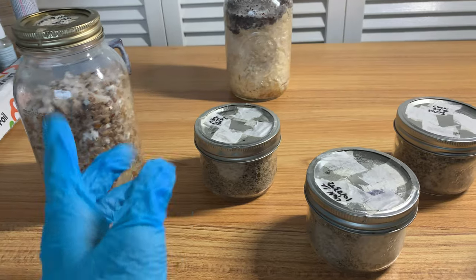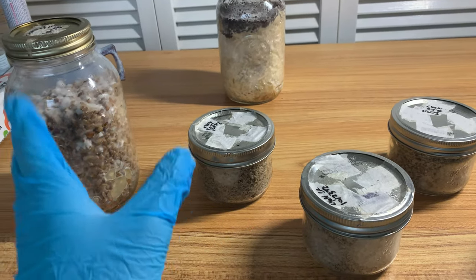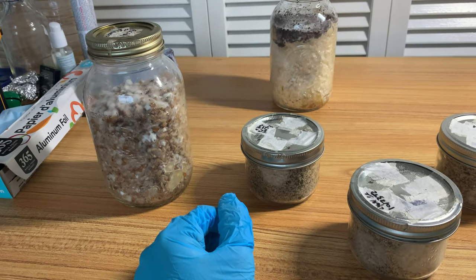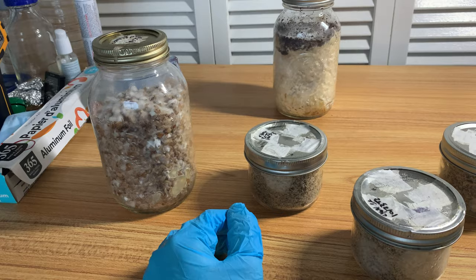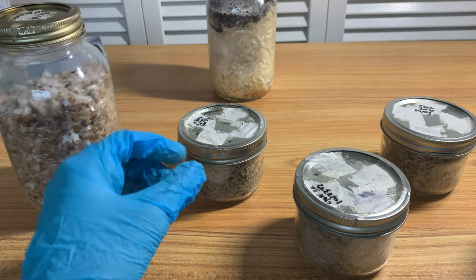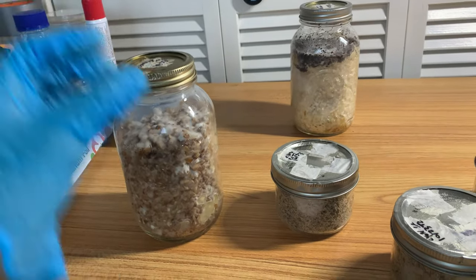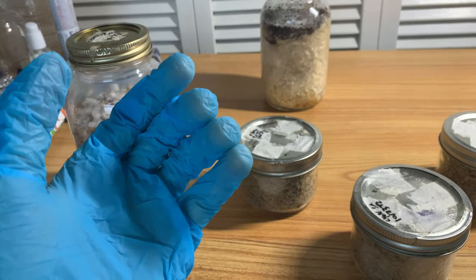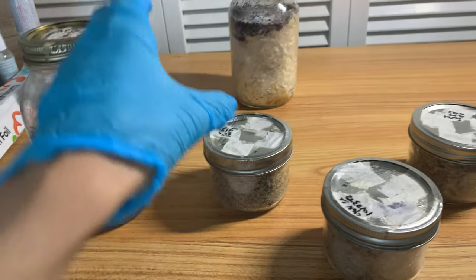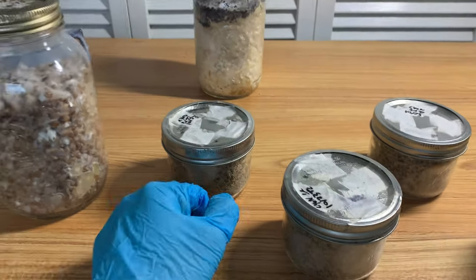Why would you want to do that? Well, it's easier and quicker to prepare than a liquid culture. On the other hand, you would basically make it when you want to use it. Whereas with liquid culture, you could store it for a while, and you get much faster inoculation times in theory. With a blenderless liquid inoculant, you take a jar, put a little bit of sterile water in there, take an agar wedge, drop that agar wedge inside the jar, then you shake the crap out of it. The agar wedge starts breaking into numerous pieces, then you basically put it into grain jars little by little, and it works.